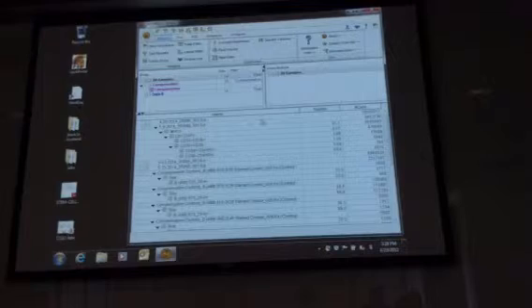The reason why we're giving you this is because this is flow cytometry in the real world. This is the actual data that we collected from cord blood, where we were trying to identify the relative proportion of the different subsets of cells between different collections of cord blood.